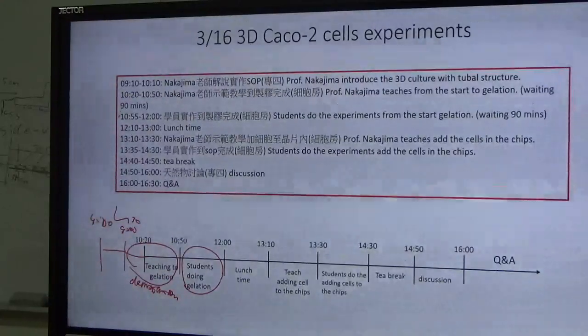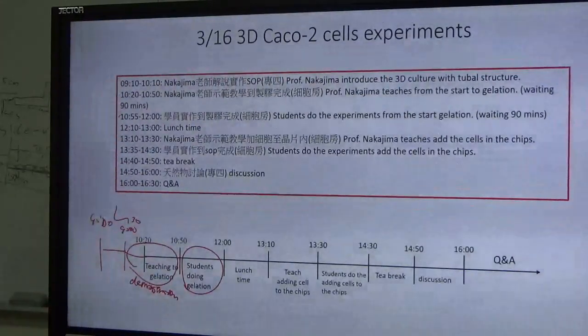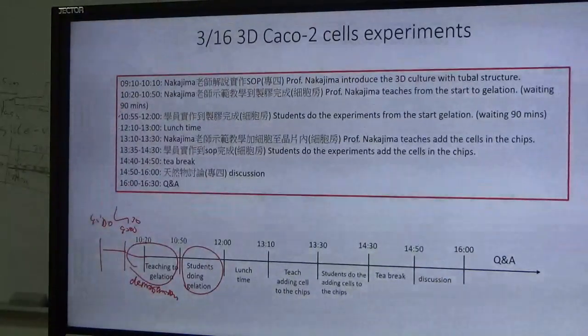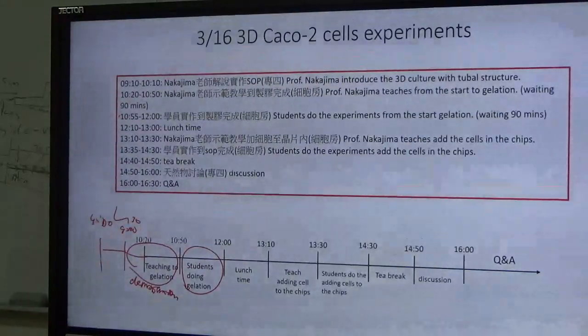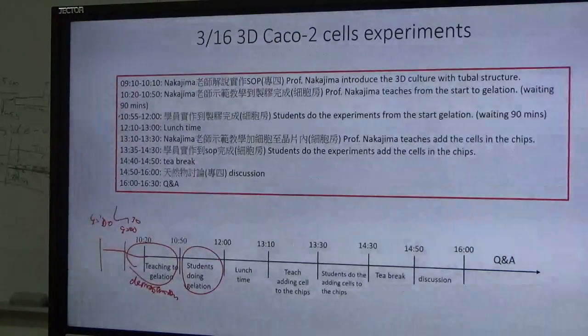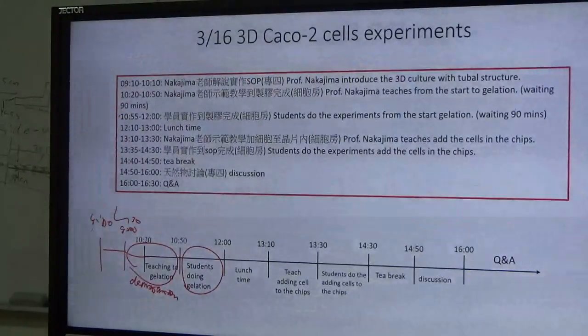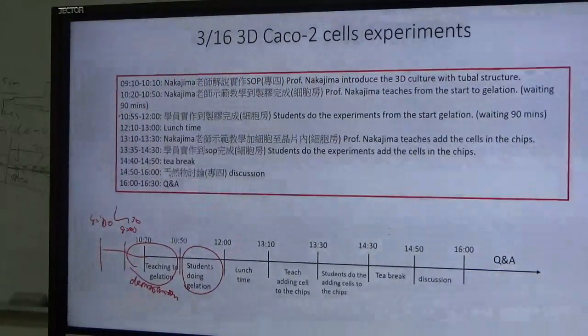We have the small one with two laminar flows, and the outside another laminar flow where you will teach. So tomorrow you can use the laminar flow to demonstrate so everyone understands, then one by one go to culture and try.